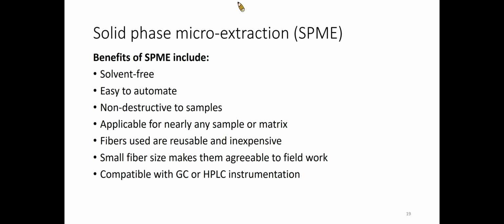The advantages of using SPME include: solvent-free, easy to automate, non-destructive to samples, extensive applicability, fibers are reusable, and compatible with GC or HPLC instrumentations.